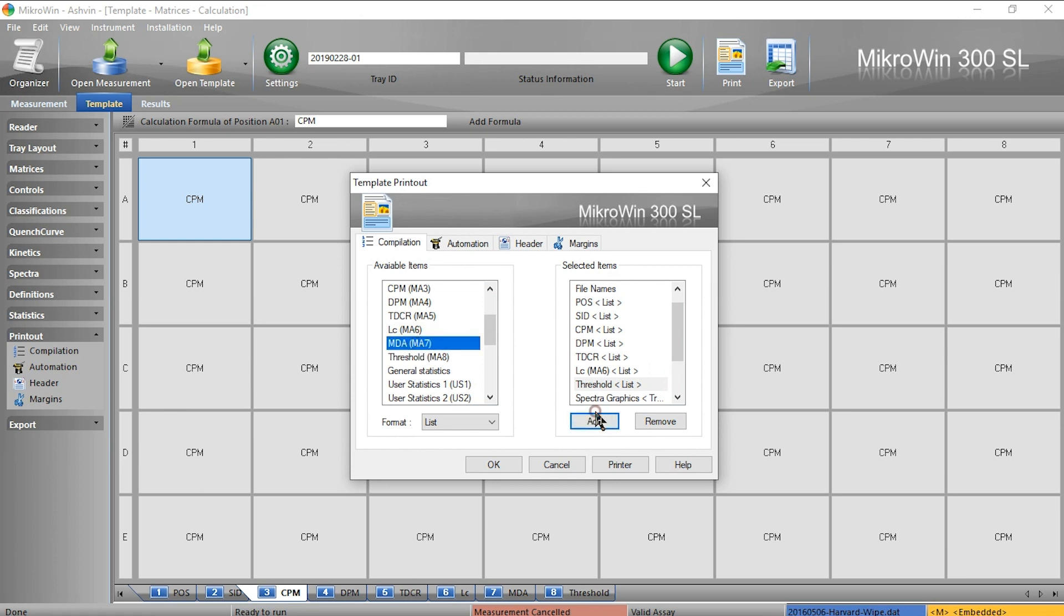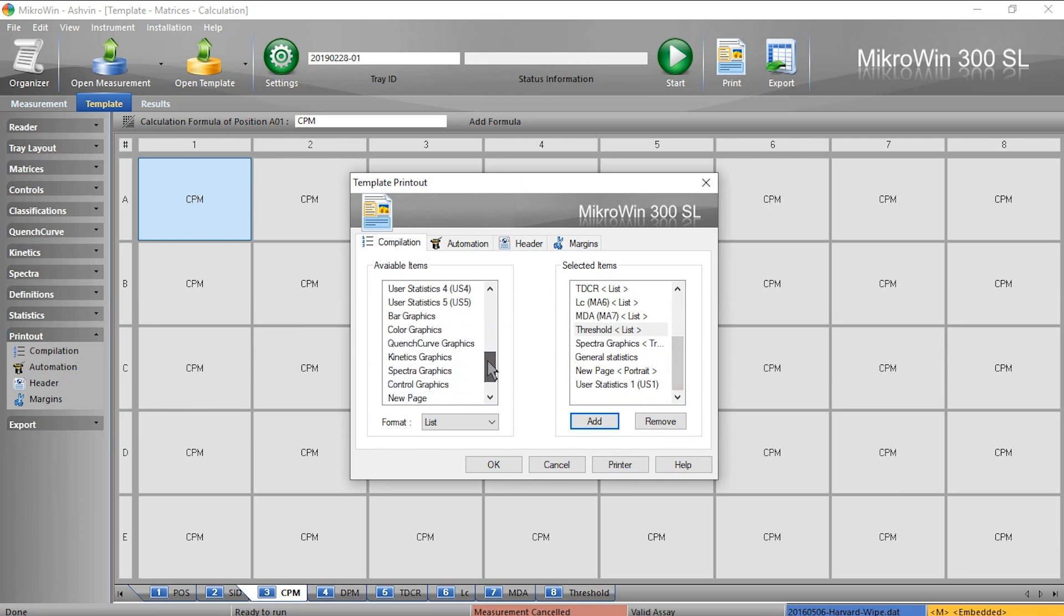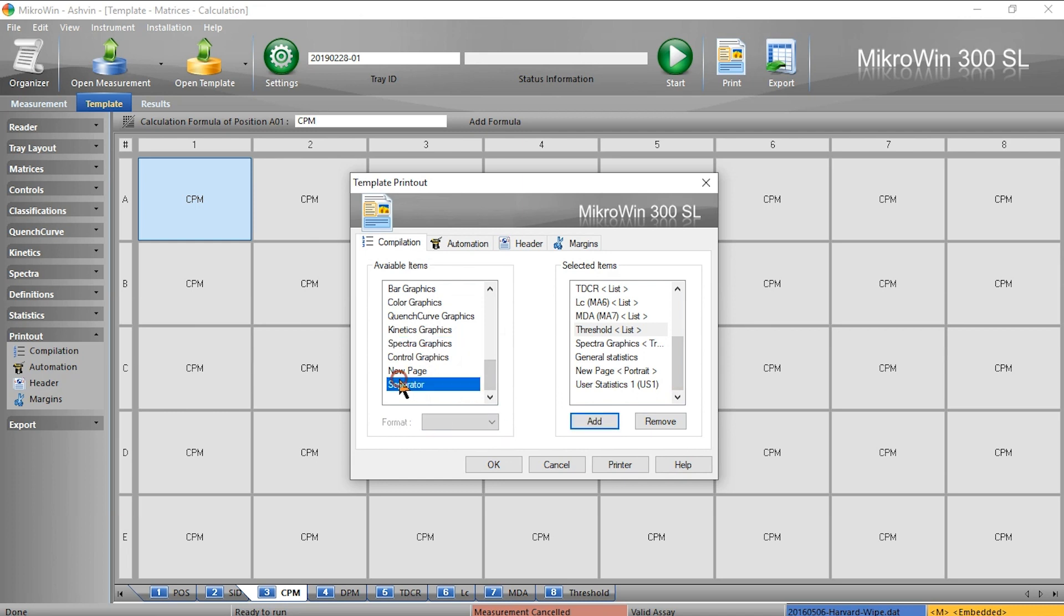I even have the options to select a spectrum. Tray is the recommended format for this as it shows all of the samples and separators, or new page if I wanted to break up and partition my data.